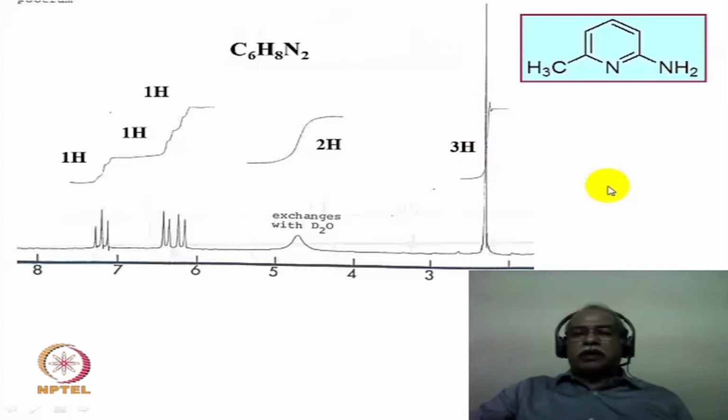So what we have seen in this module is a number of proton NMR spectra and the interpretation of these spectra, to make yourself familiar with the chemical shift values and coupling constant values. We still have not seen an example of how to calculate the chemical shift and the coupling constant value from the spectrum, which we will see in the next module.